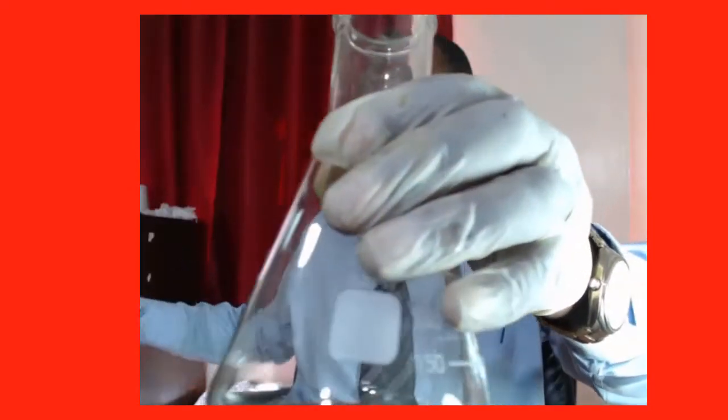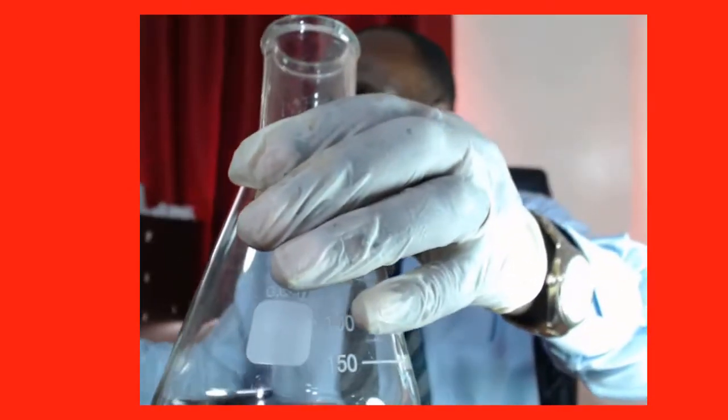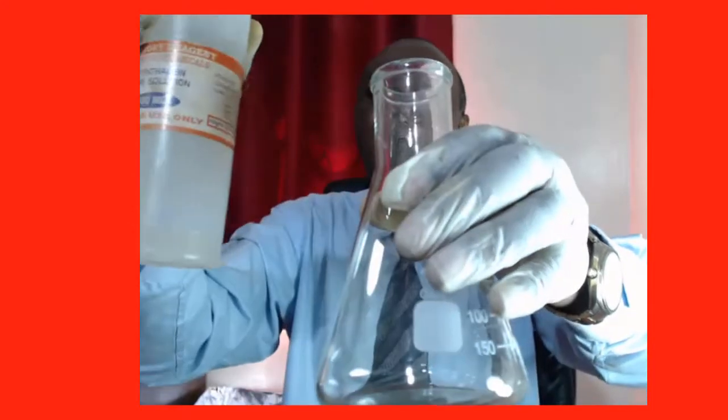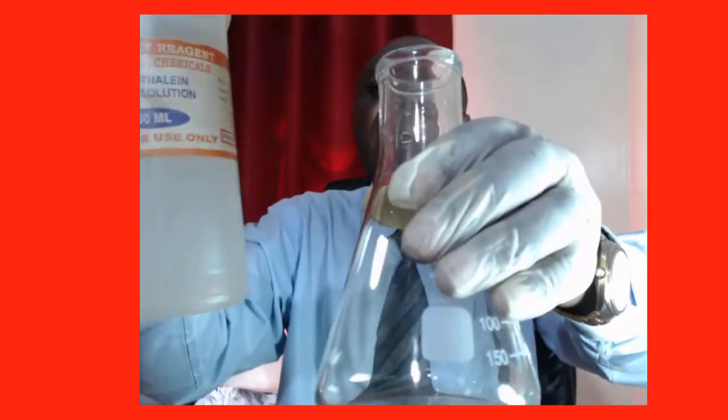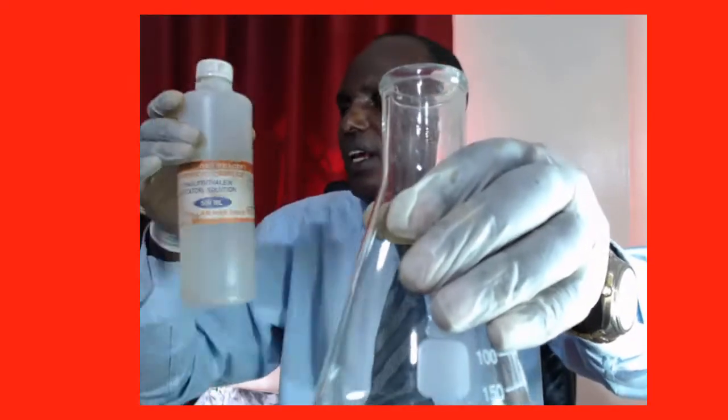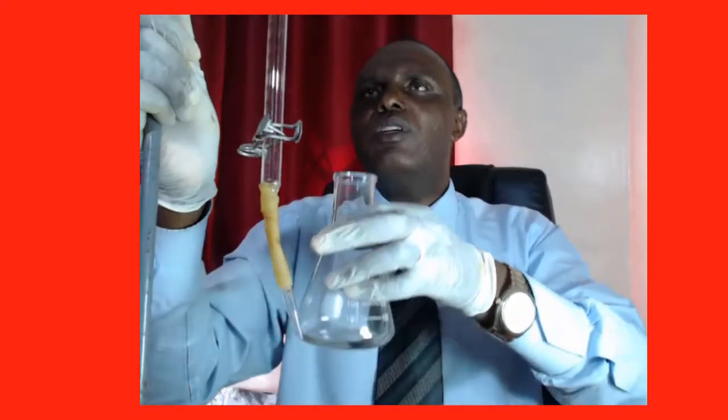Then after that, we are going to add this indicator. This indicator will make the solution look pink. It is called phenolphthalein indicator. And then we are going to react the two solutions here. When the other solution runs down from this burette, when the reaction is over, we will be able to see that it is over.